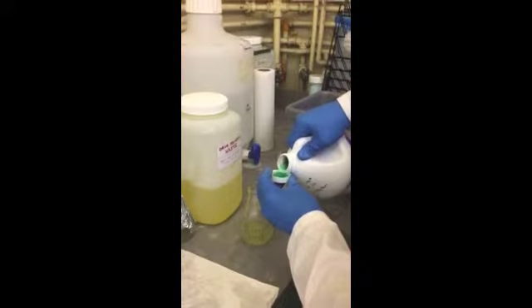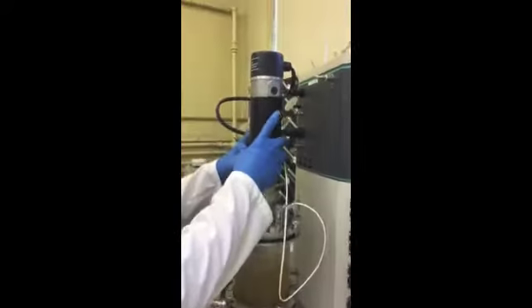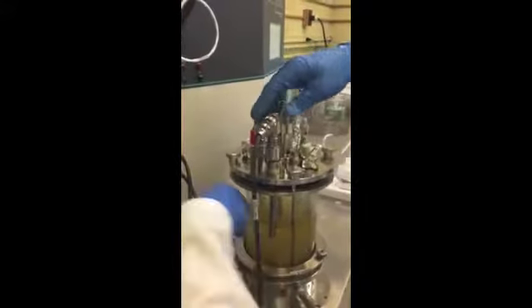For cleanup, place detergent in every flask that has E. coli. To disassemble the bioreactor, start by taking off the motor. Then disconnect the temperature probe, followed by the pH probe and DO probes.